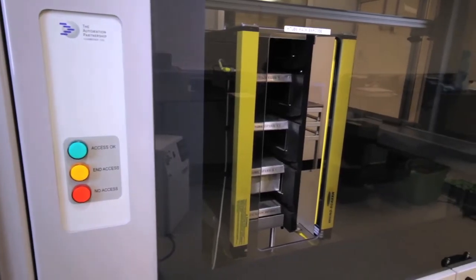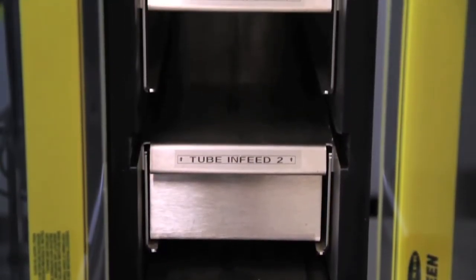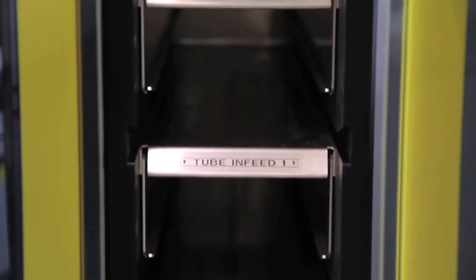This tube loading unit provides access to place and transfer the racks of tubes, with a total capacity of 12 racks, containing 96 tubes each at a time.